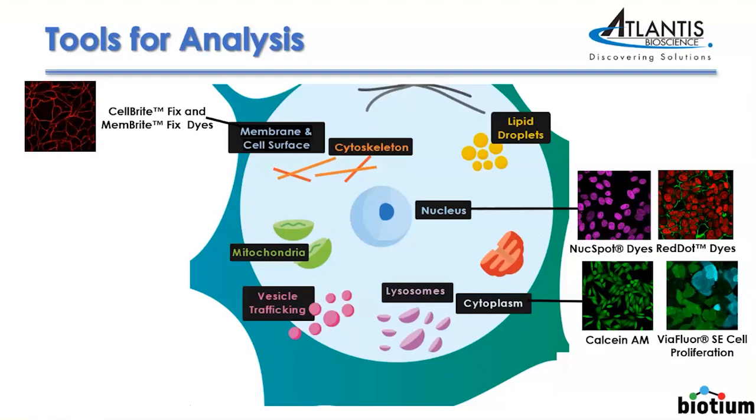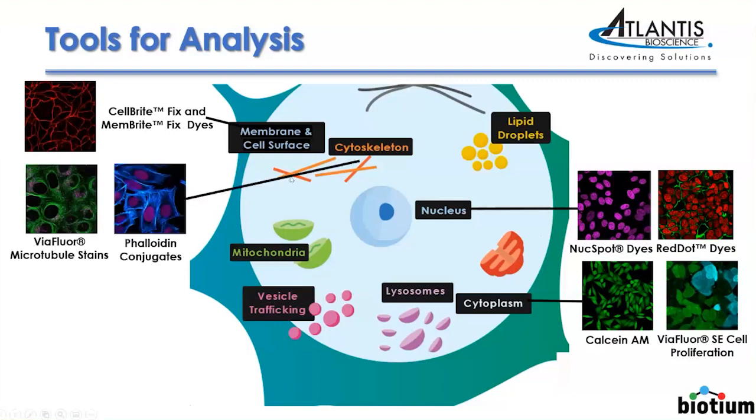One thing I want to highlight here is that these dyes are able to withstand permeabilization, so they allow both surface staining and intracellular staining.